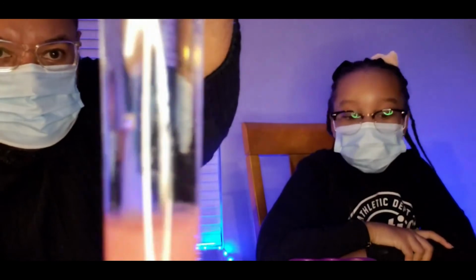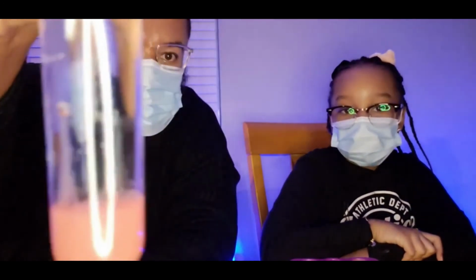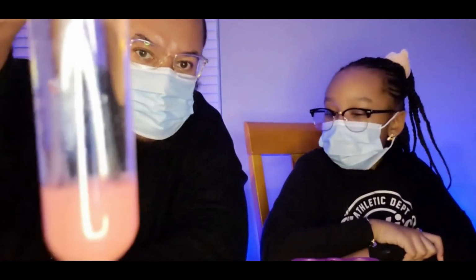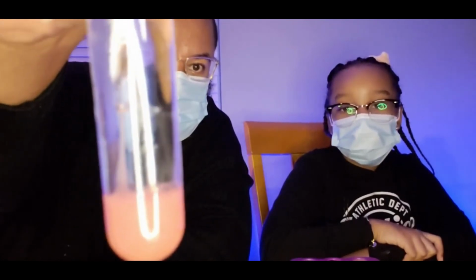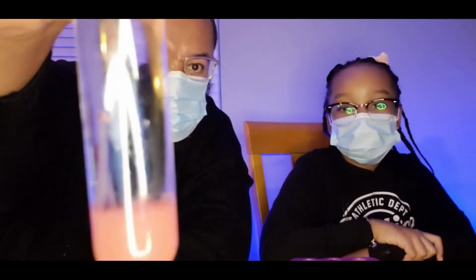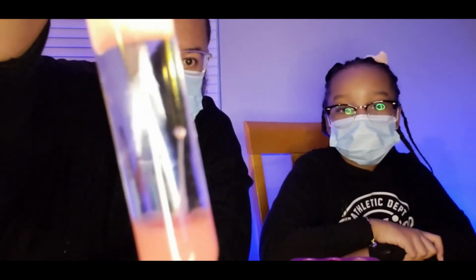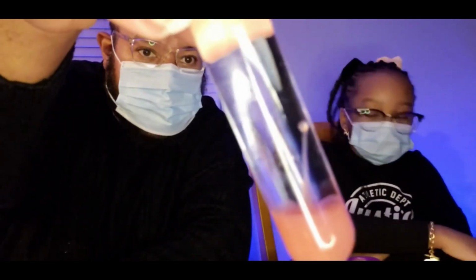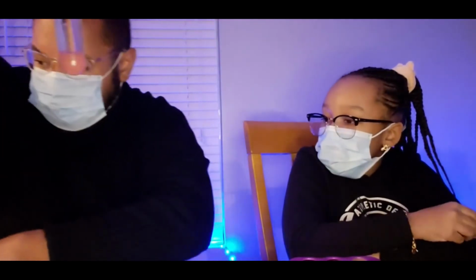With a magnifying glass, see if I can get this to focus. But right here in the middle, there's a white blob, with like a bubble on top. And that is the DNA starting to separate already. As I turn it, you can see that. You see it right there? It looks like a strand with a bubble on top. Where's the magnifying glass? The magnifying glass is over here.